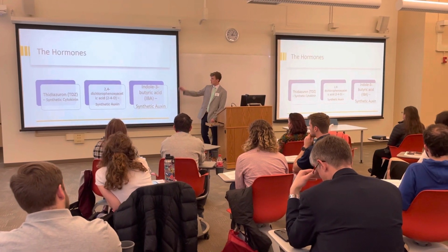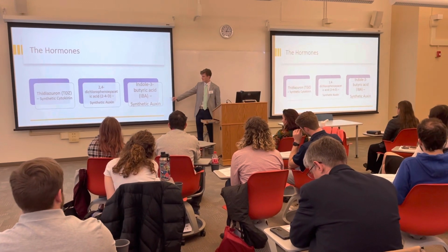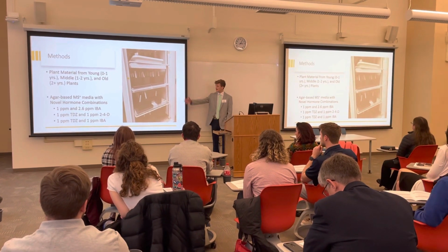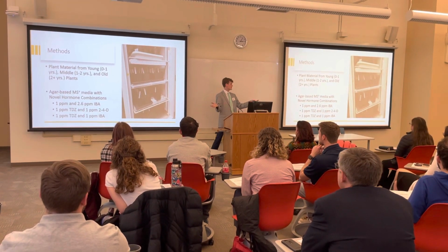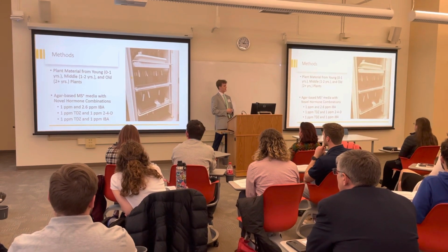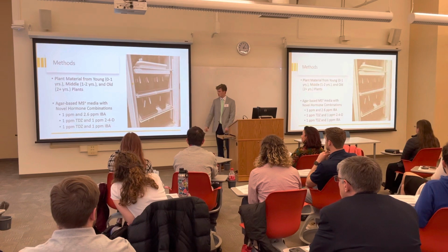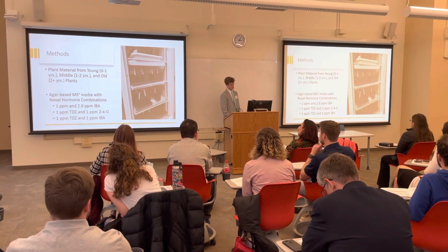Three hormones are used. TDZ is a cytokinin, 2,4-D is an auxin, IBA is an auxin. So, TDZ, shoots. Everything else, roots. Our methods, again, talking about the age difference, we're using 3 different age categories: 0 to 1 years, young plants; 1 to 2 years, middle-aged plants; and 2+ years, old plants. Those old plants, we call them old because they've already got preformed flower buds. And remember, that flowering switch is something that we are concerned about. We don't think it's going to allow us to initiate into tissue culture. We're using 3 different combinations here, and I'll talk about those as I get to the results for those sections.